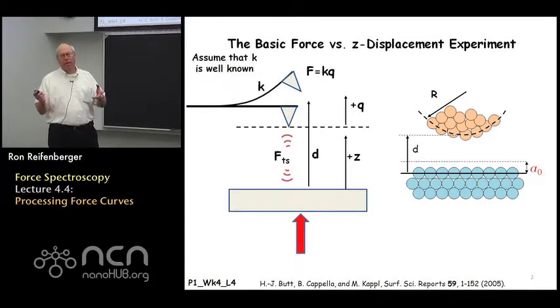So what I like to do is run through about 2 or 3 real simple examples, show you how to think your way through, how to calibrate the data that comes out of the microscope. I'd like to talk a little bit about artifacts, problems that you may run into when you do these experiments.